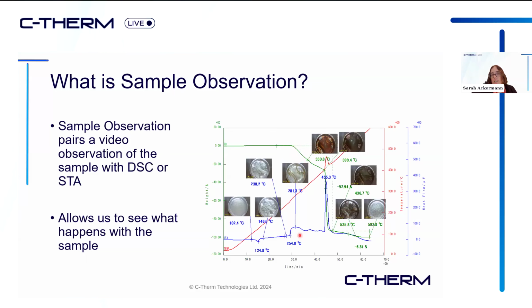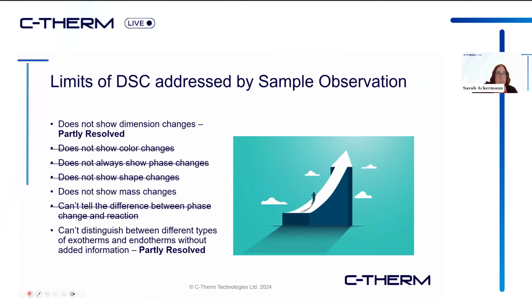So this is not a glass transition, but it's the start of the broad exotherm, actually. And as we continue through the still video, we can see the sample get progressively more degraded until finally combustion is complete. So this is a case example of sample observation.